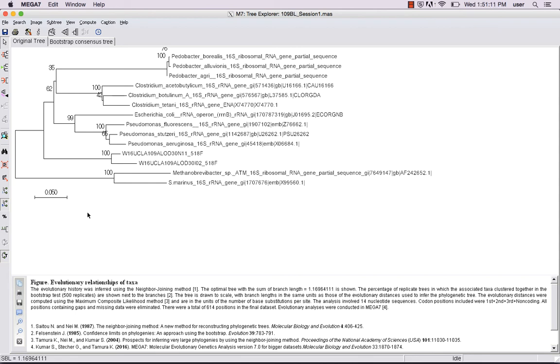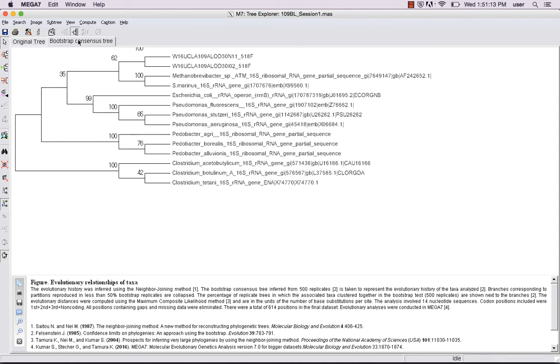The bootstrap consensus tree is a helpful view to examine the clades within the phylogenetic tree more closely. Pay attention not only to the bootstrapping values, but also the relationships among each taxon. Ideally, an unknown query sequence will be included into a defined clade with strong statistical support.